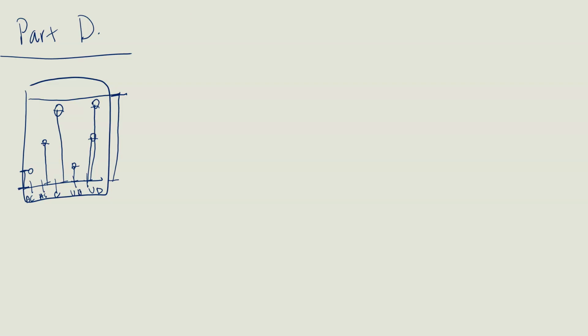Now, the RF value. You probably, with your eyeballs, were able to make some judgments here. Like, for unknown B, that spot right there looks a lot like that spot. And that spot's acetaminophen. So it kind of looks like unknown B is acetaminophen. Unknown D, that spot looks like that one, which is aspirin, and that spot looks like that one, which is caffeine. So it probably has aspirin and caffeine in it. And again, that's just by you looking with your eyeballs.